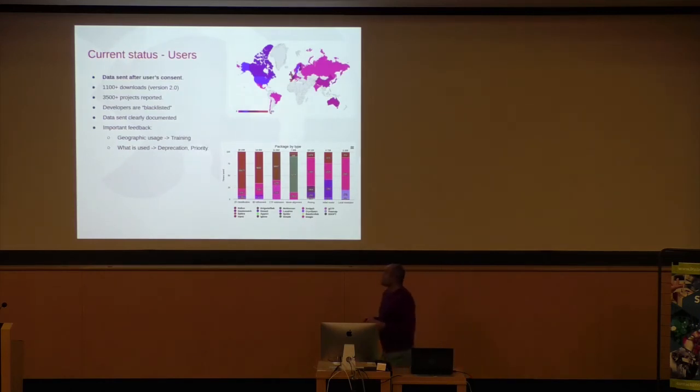Scipion can send usage statistics. This is very important for us. Obviously, you need to give consent. Otherwise, Scipion will not do it. And it's clearly defined what this sends. It's very minimal information, nothing that compromises your research, just a list of methods. And this is used to basically have a map of where Scipion is being used and have a ranking of usage of the methods.